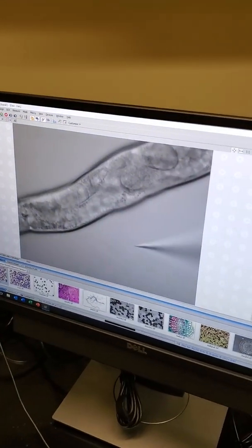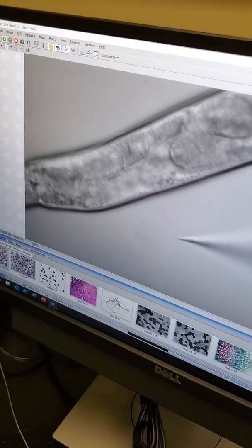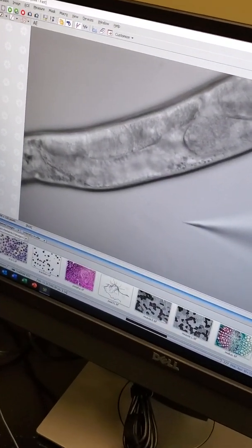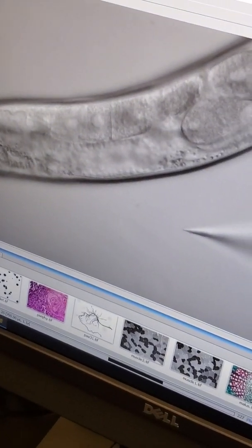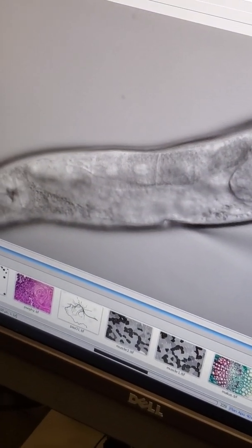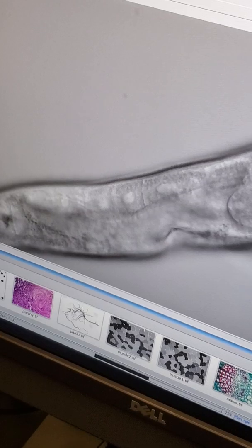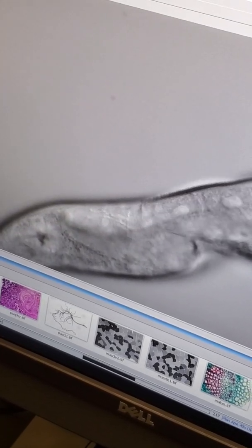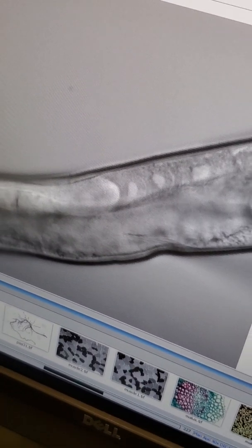Okay, and just to show you guys one more time, we're going to inject the same worm. So when you're injecting the worm, you're targeting either the anterior or posterior arms of the gonad. So we started with the posterior arm. Now we've moved over to the anterior arm. And I think you can actually see, maybe you can see some liquid already in the gonad from the first injection. But there you can see the liquid really clearly flow that time.